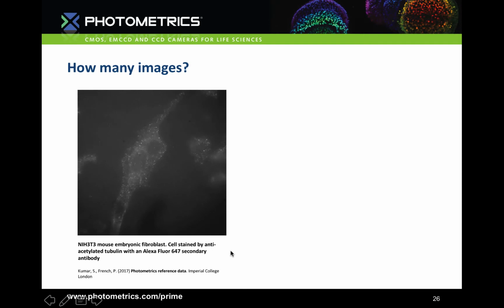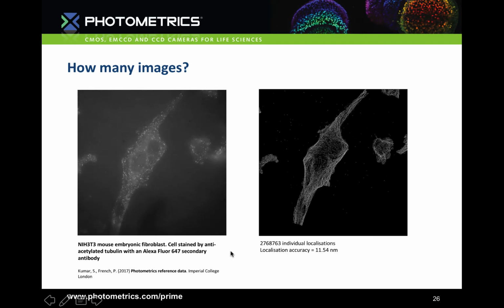The result of the full 30,000 frames is the image on the right, and you can see that almost 3 million individual molecules were localized to produce it. It goes without saying that localization-based super-resolution data is very large in size and takes a considerable amount of time to collect.